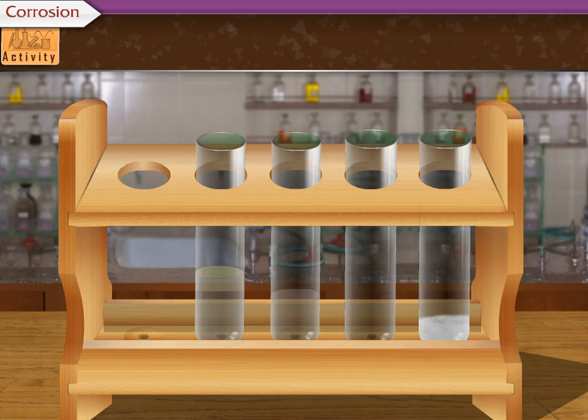Now, in each test tube, let us place a small iron nail. Close the fourth test tube with a rubber cork. Keep all the four test tubes unattended for a few days.